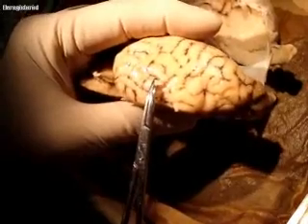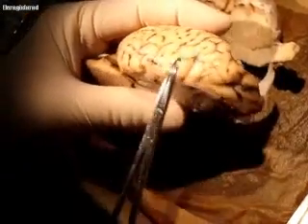Watch your fingers, Kevin. He's cutting it sort of weird. Okay, just don't want him to hurt himself.